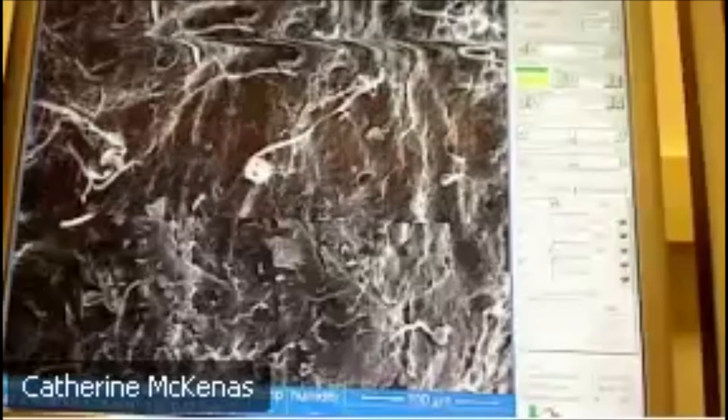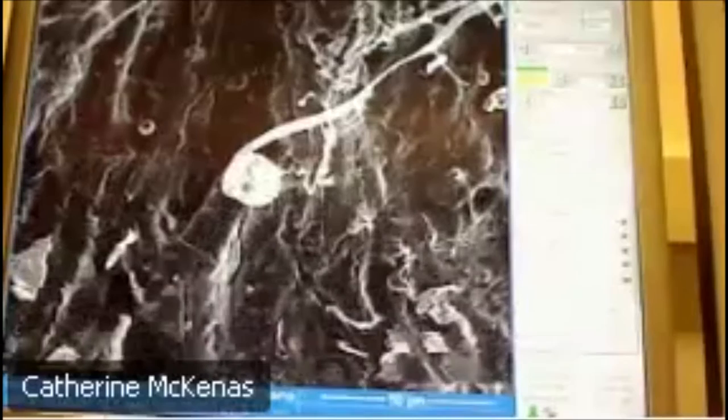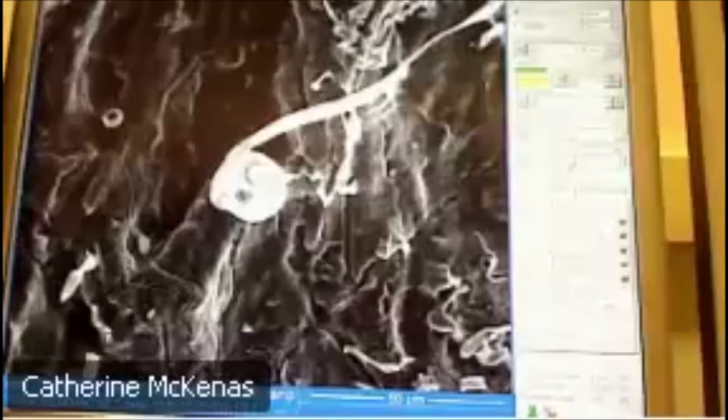Much bigger than you normally see poop. We're going to zoom in on it, and we found some pretty interesting things in here that we want to talk through with y'all. Okay, so we're going to have to zoom in pretty far so y'all can see it with the video. Do you start to see, kind of in the middle of the screen, us coming in on this round feature? Yeah. Round feature with a tail? Okay, so this, we believe, is actually a seed.